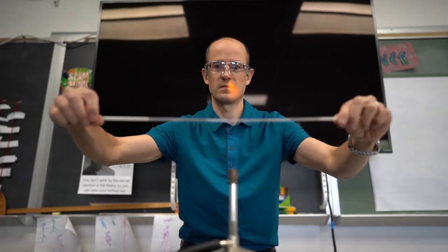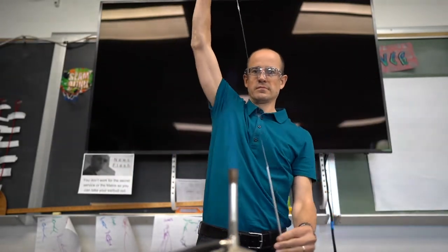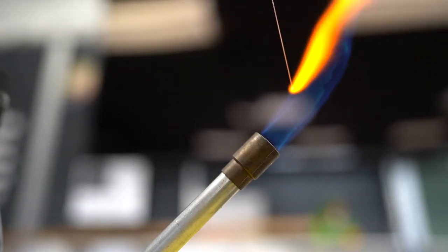Now most of us are not going to have access to a Bunsen burner and thin glass to be able to stretch it out, then break it and melt it down into a tiny little glass ball like this.